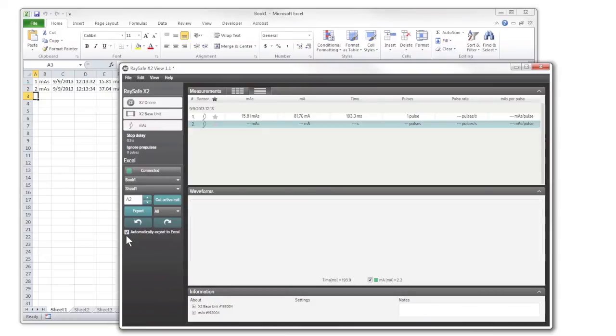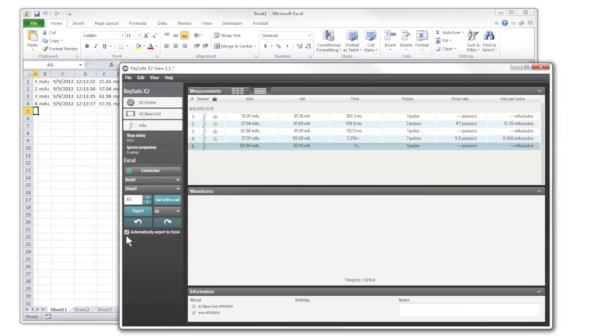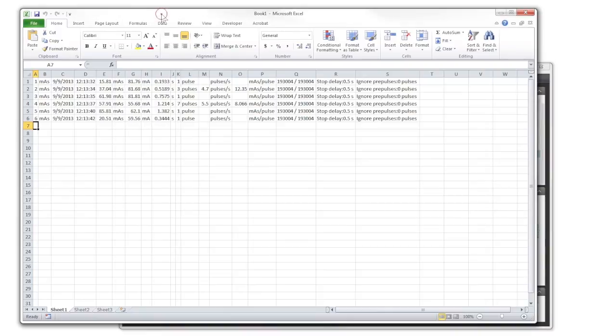When making a measurement, you can see the measurement data is automatically sent to Excel. Now you can make your own Excel templates to spice up your presentation. Thank you.